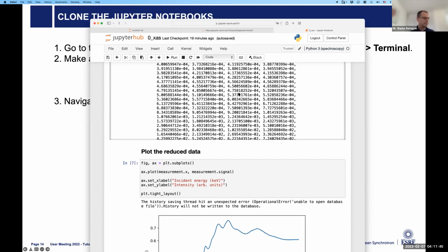If I now copy all this data to the ESRF, we will not get those resources at the ESRF. Exactly, it's not a problem of resources. It's not very comfortable to copy all our data to the ESRF and then analyze it there. So the idea is obviously to copy the data from the ESRF to our own computer.